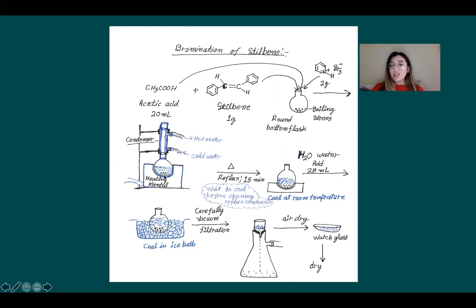This should be like an orangey color, so we're going to wait for it to dissolve, and everything should be dissolved after you take it off. I suggest for the first 12 minutes to heat it at 6, and then for reflux to turn it up to about 8 for about 12-ish, 15-ish minutes until everything is dissolved. Afterwards, we're going to wait for it to cool. Do not take it off immediately and just pour it into your water.